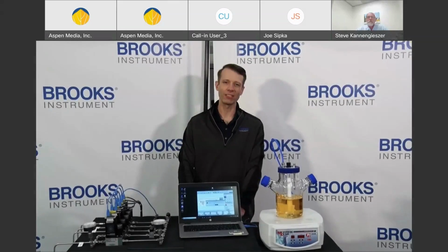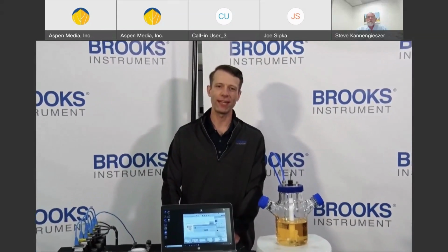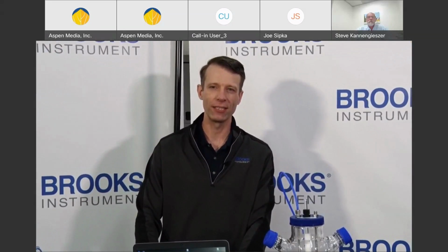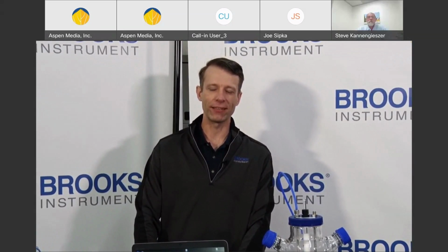Hi, I'm Kyle Smith. I'm the Technical Services Manager with Brooks Instrument. Today I'm going to talk to you about the importance of the MFC zero in the bioreactor process. Good zero is crucial to ensure the MFC's accuracy is maintained.